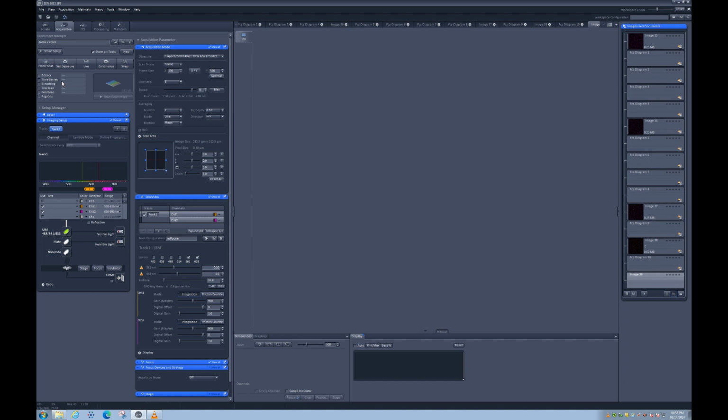In this part, I will show how you would do SPP if you do not have the FCS mode in your microscope. And of course, FCS mode is probably a little bit more convenient, but on the other hand, there is a neat trick that will allow you to do single particle profiler even if your microscope doesn't have this FCS mode. So what do we do?